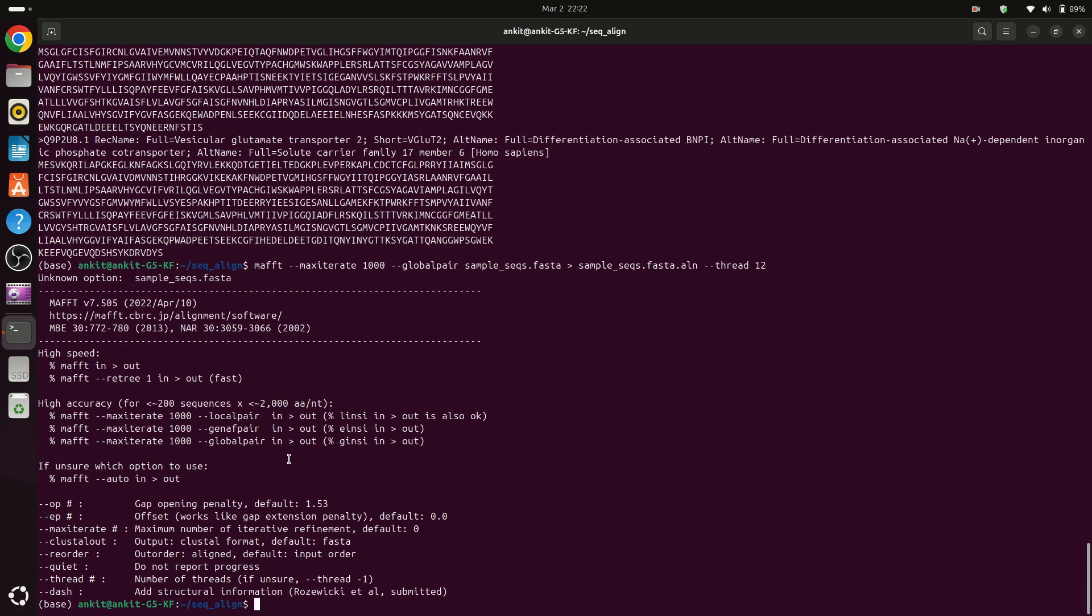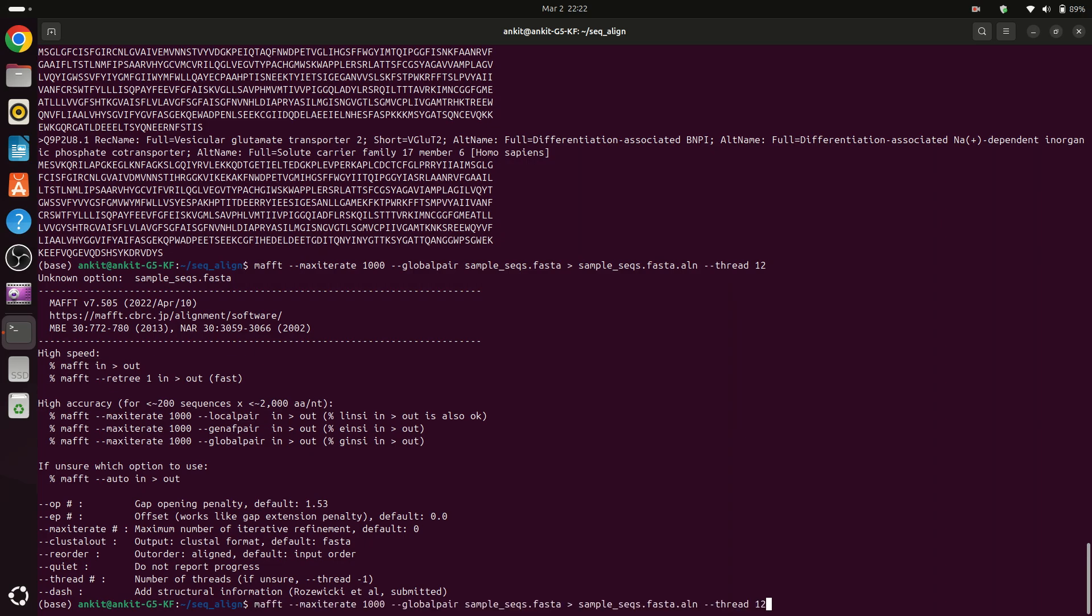Unknown option sample.fasta. Okay, I can see here that the number of threads should be provided before input and output file.